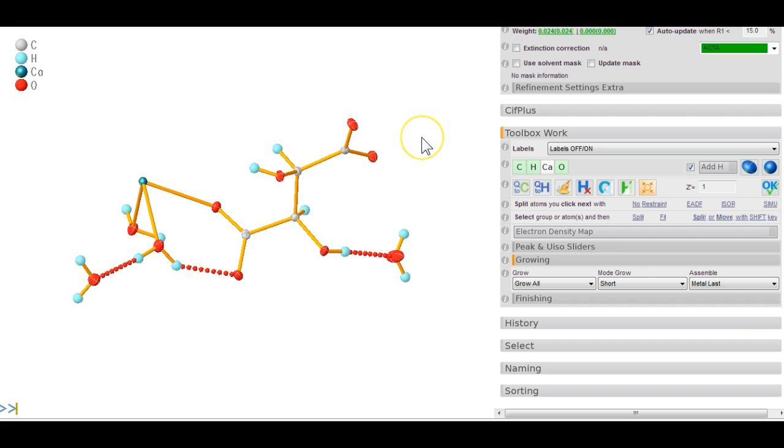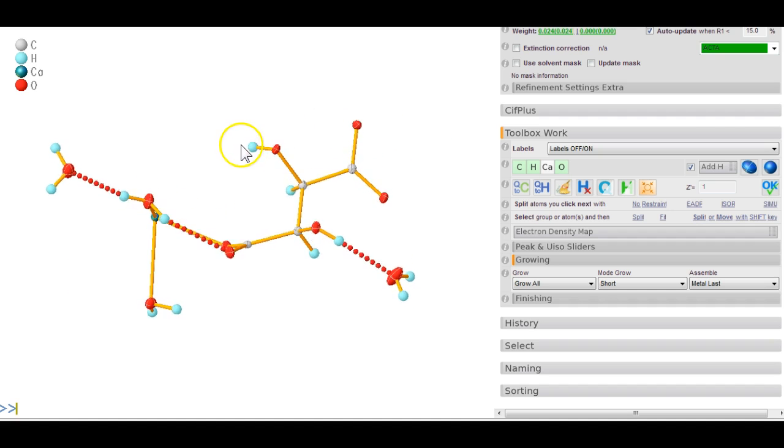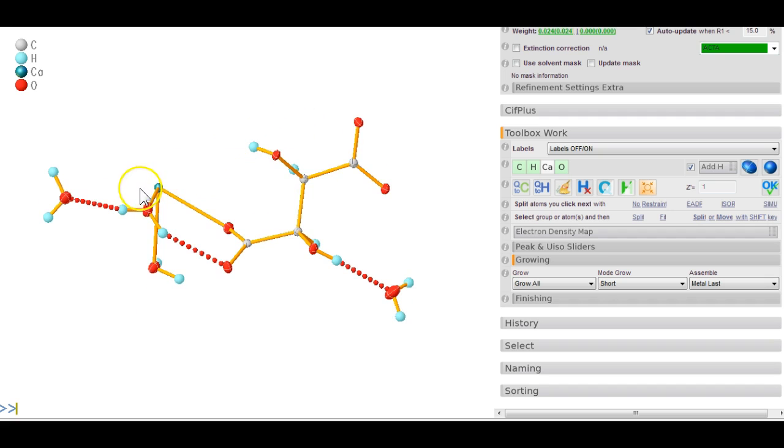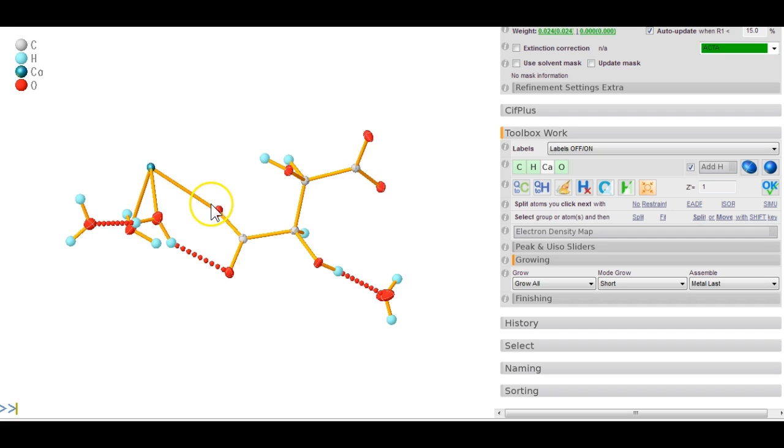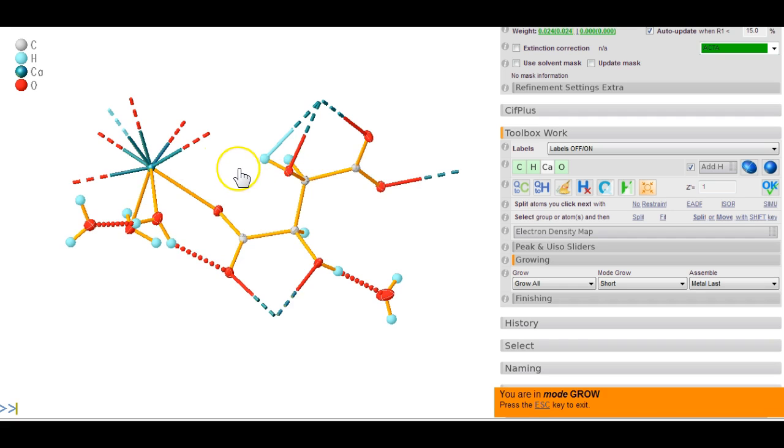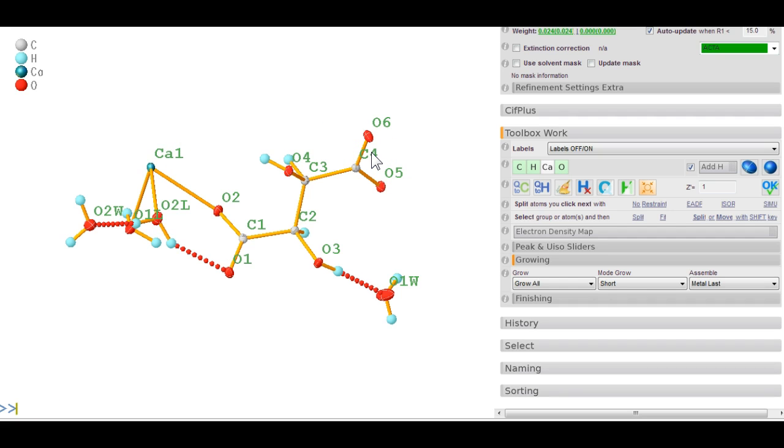We see the tartrate molecule here and the metal here, but some of these things bond to this. Control G shows where this goes—to calcium one and oxygen six. Press F3 to get labels. Oxygen six is this one, so there's a bond between this and this. You have to make a decision of what you want to actually show.